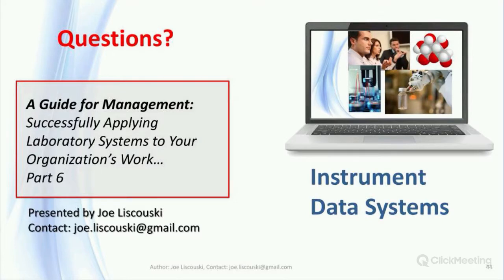Some of them are shared systems. Some of them are cloud systems. The faster response that you need from an instrument system, the closer you want the computer to be to that system. So a LIMS that may be operating in a cloud isn't going to help very much with an instrument that's working in your laboratory when somebody's standing in front of a screen waiting for a response.